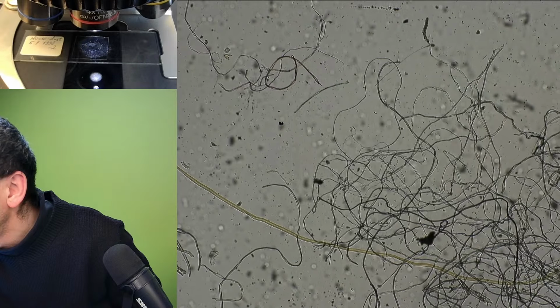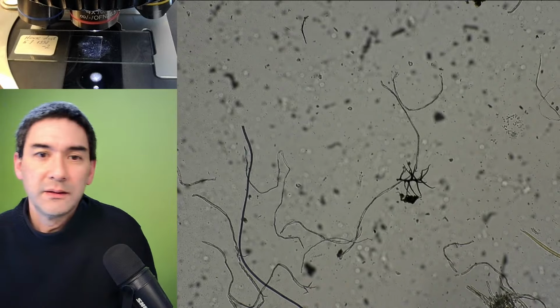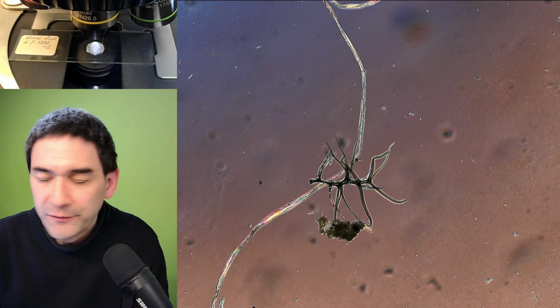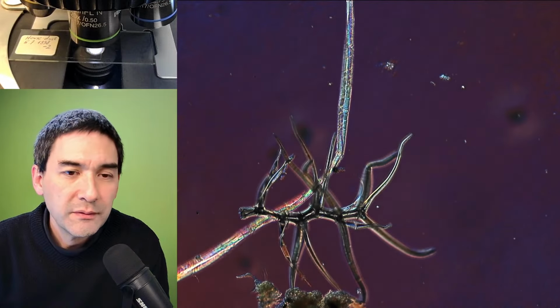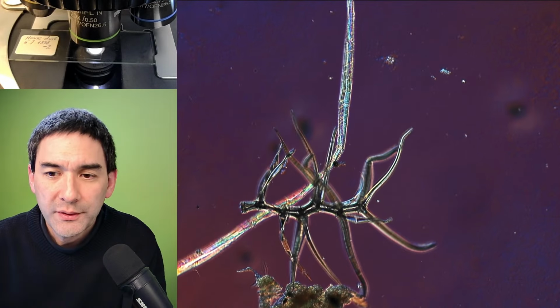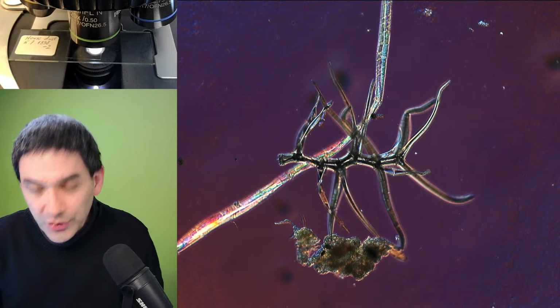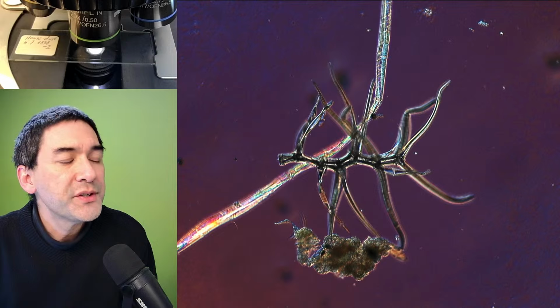That's again the fibers here. Here it is. Yeah, that's the thing. That's the thing here, right in the center. Yep. This one I found out fairly quickly what it is. They are also quite common. Those weird structures, and you probably want to see the comparison here.